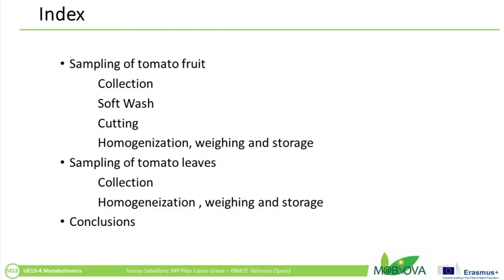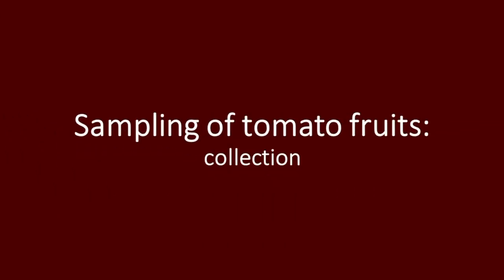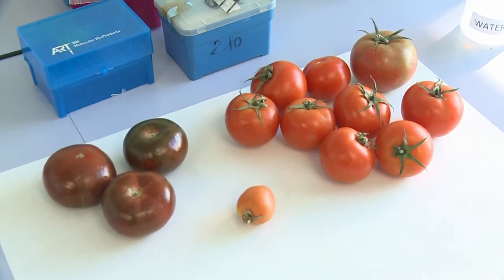To perform a good analysis, the collection and manipulation of the samples has to be done with the greatest care. Then, a correct tomato fruit and leaf collection, processing, weighing, and storage will be described step by step. Now, we will describe a correct protocol for tomato fruit manipulation.